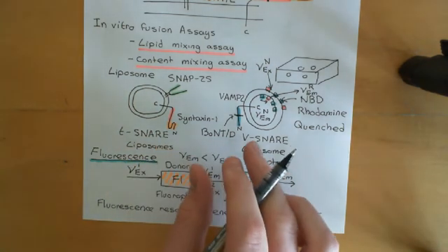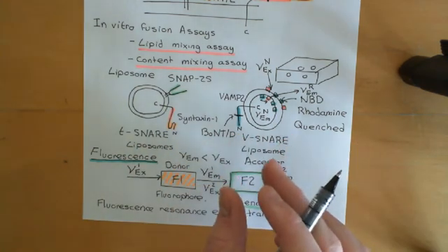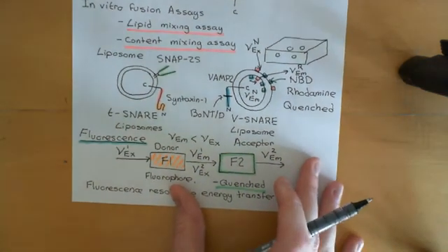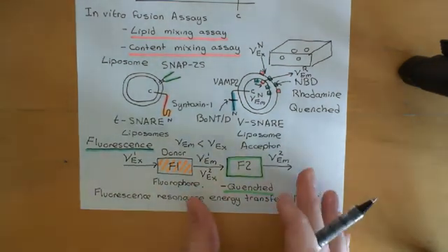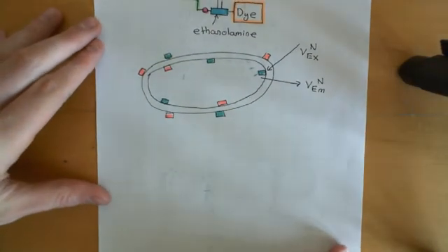So you'd want to subtract whatever that signal is from the signal that you get in the non-control where the snares are intact. So that's your control to make sure that you can subtract off the non-snare-mediated fusion, or the snare-independent fusion as it's usually called.